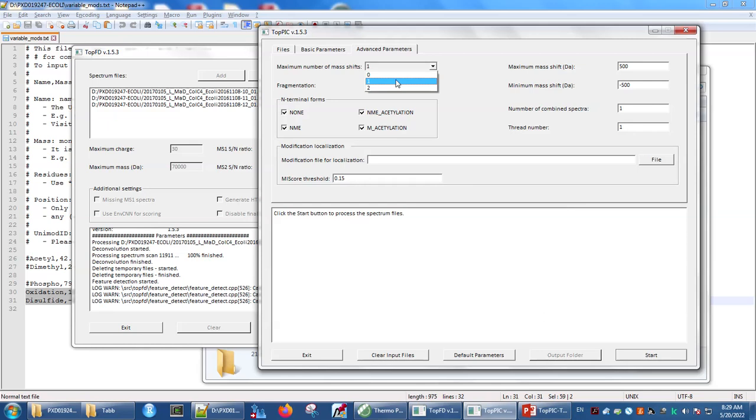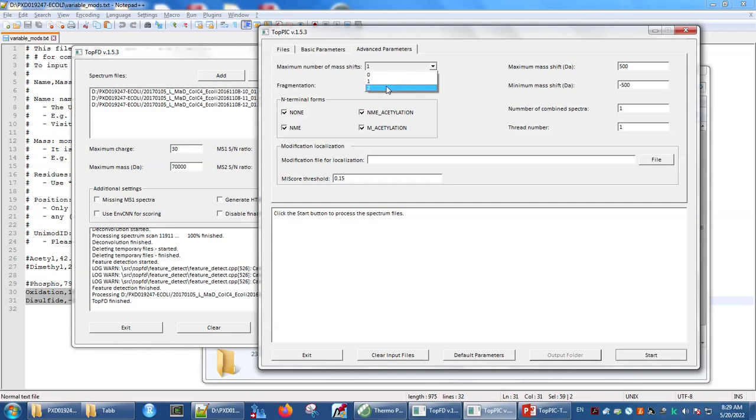If I set it to 1, it's going to allow for one region of mismatch between the ladder of peaks seen in the spectrum and what the ladder should look like from the proteoform. If I want to look more extensively for PTMs, I would look for the option 2. But 1 is pretty good if you're just trying to spot the occasional oxidation and the occasional cysteine disulfide.